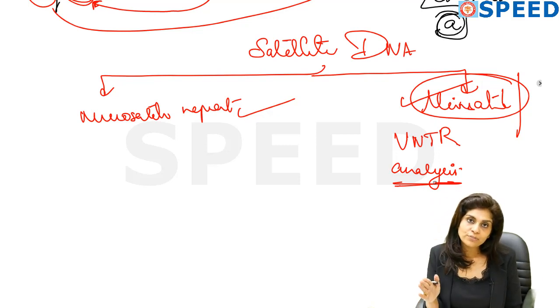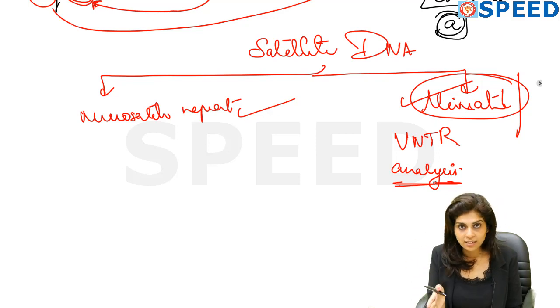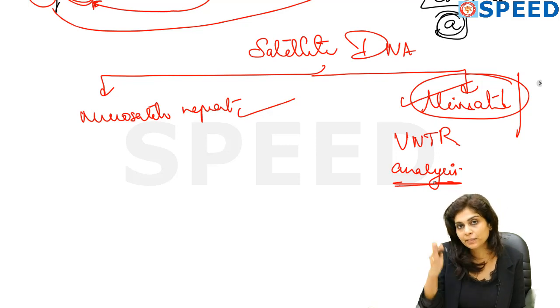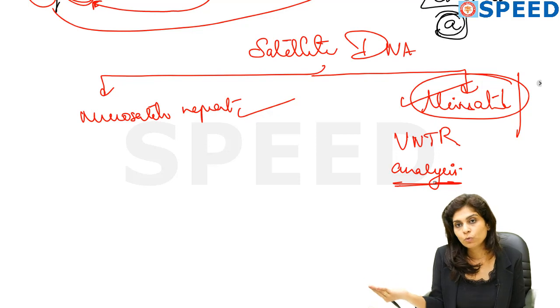Northern blotting is used for identifying unknown RNA, and because RNAs are mostly single-stranded, the denaturation step in northern blotting will be milder. Again, why do you employ a denaturation step at all? Because single-stranded RNAs would have formed hairpin loops. With hairpin loops, they won't be able to hybridize with probes.